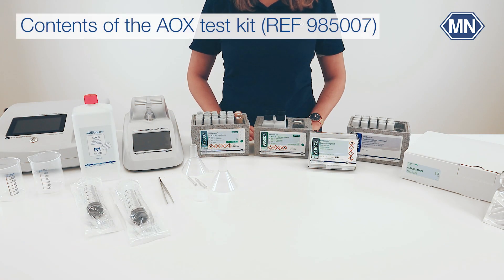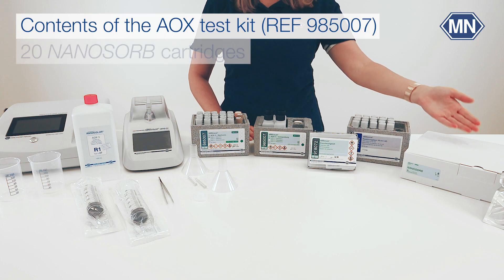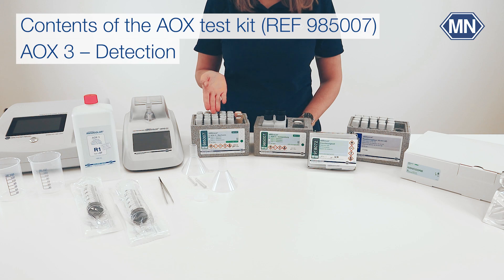The Nanocolor AOX kit contains 4 boxes sufficient for 20 determinations: a box of empty test tubes, a box with 20 NANOSORB cartridges, one box for the preparation and one for the detection.